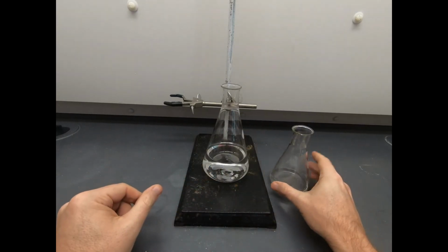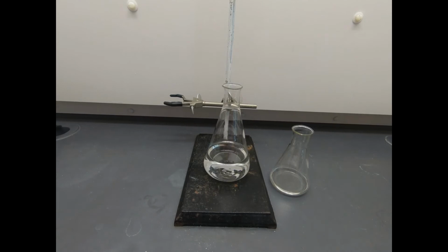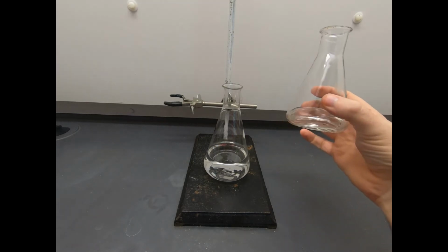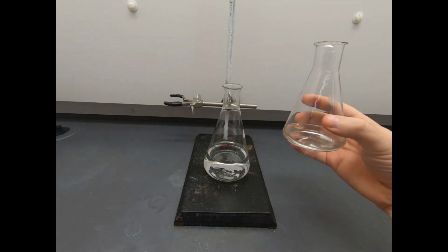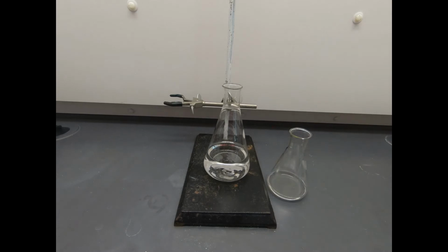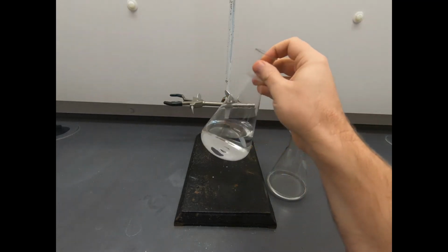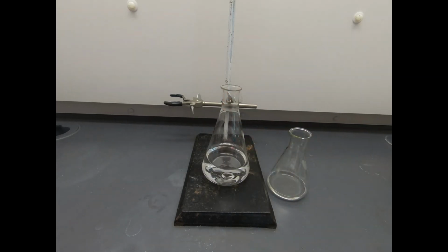So what we have in this larger flask is about 250 milliliters of water. Now I've done this experiment in the past, and what I found is that aspirin has low water solubility if the aspirin is in its neutral protonated form, its carboxylic acid form. And so not only is this about 250 milliliters of water, but it's about 1% sulfuric acid. Now 1% sulfuric acid is plenty acidic.